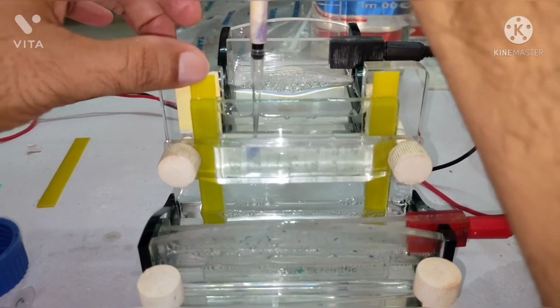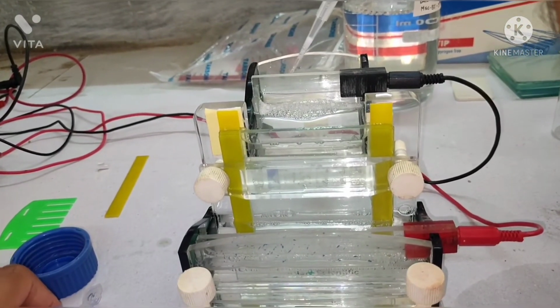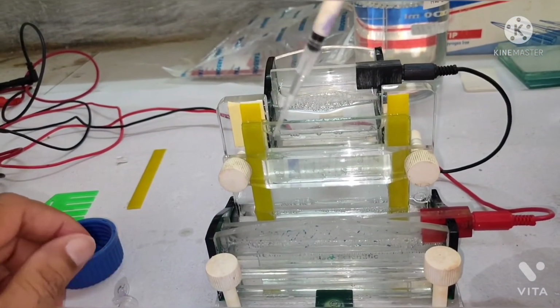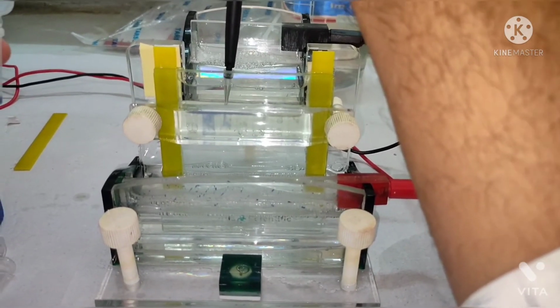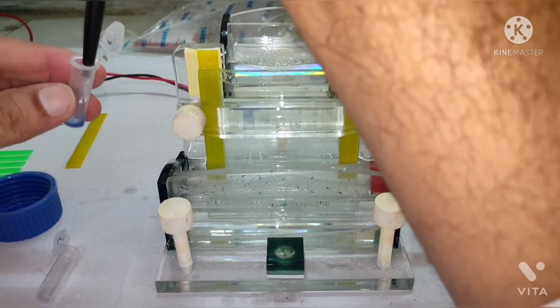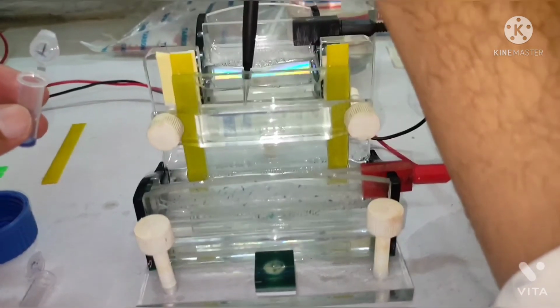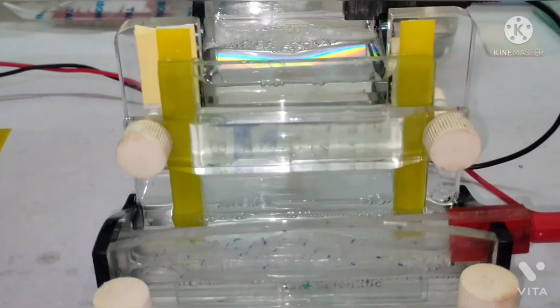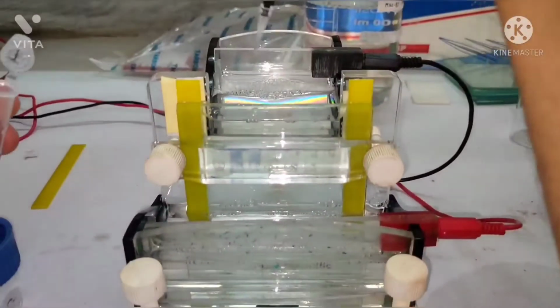Hamilton is available. Hamilton is a kind of pipette, micropipette, by which you can load. In that case your sample won't spread. Here the samples are spreading actually. Okay, no problem. So this is one sample, right? I am loading other sample. See, this is nice actually. See, by this tip I can load very smoothly, but the problem is that you can load only 10 microliter in one pipette or one shot, right? See, only 10 microliter I am loading here, but best thing is that your sample won't get spread, right?